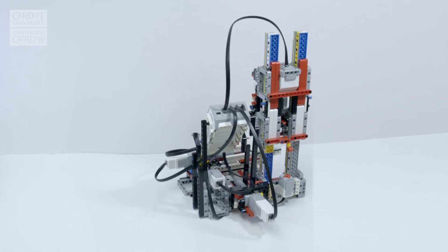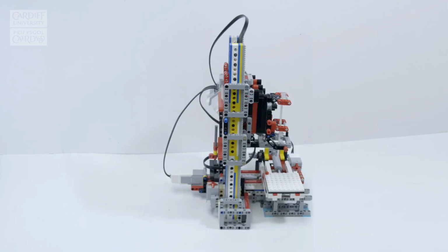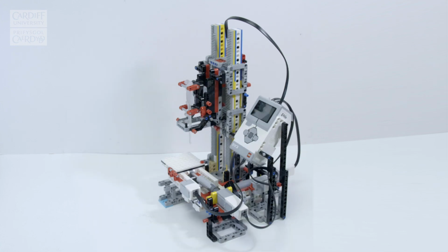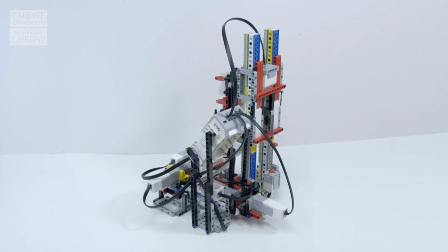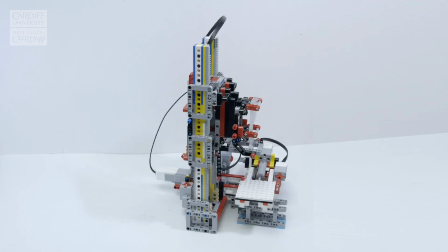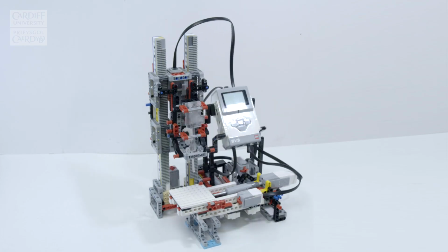We also thought that it's something that everyone is familiar with, so students who are not necessarily familiar with engineering can get their teeth into building a machine and a robot out of a material that they're already very familiar with. So this enabled students from across a diversity of backgrounds to contribute to building and evaluating this printer.